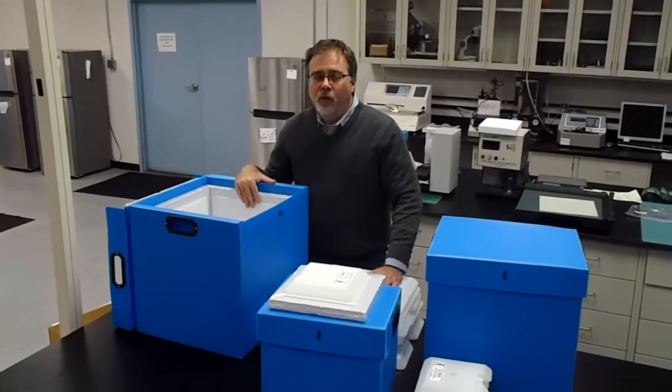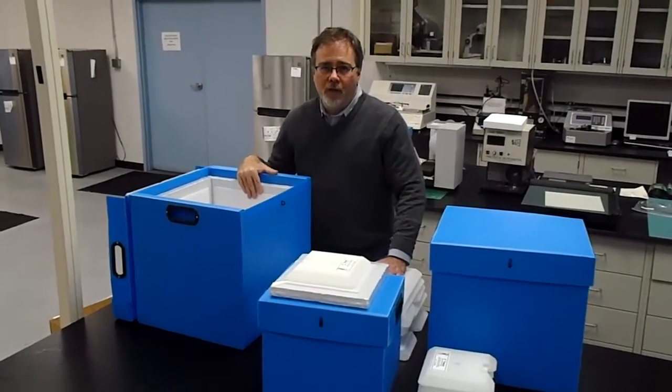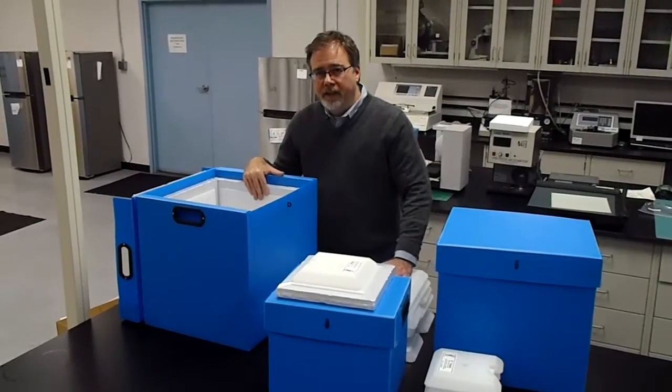This is the CryoCube line of pre-qualified insulated containers from CryoPath. This line is designed with reusability in mind.